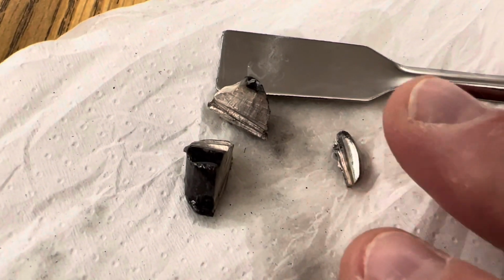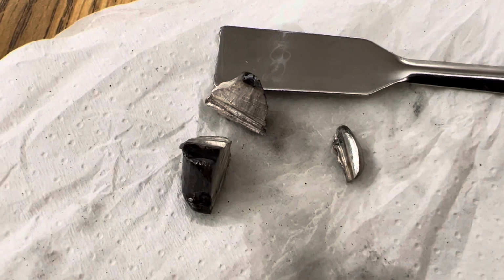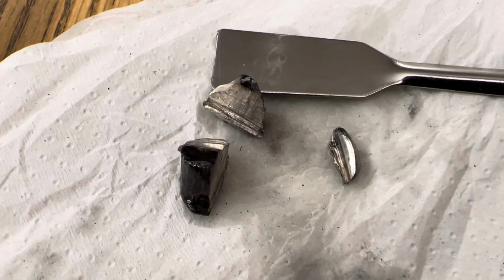Lithium only has 3 protons. It is the lightest metal on Earth. It's so light it can float on water.